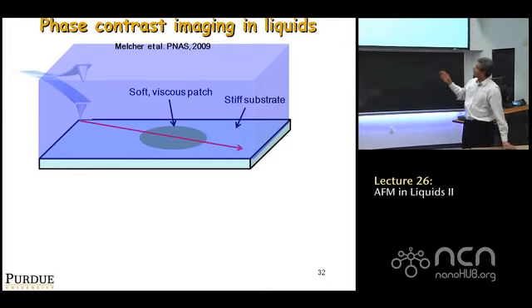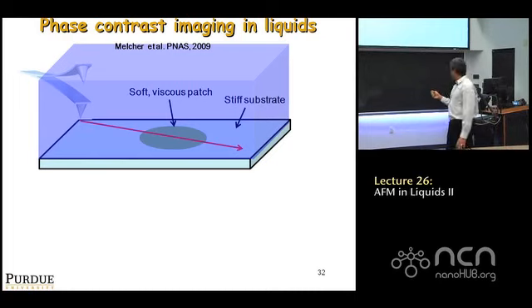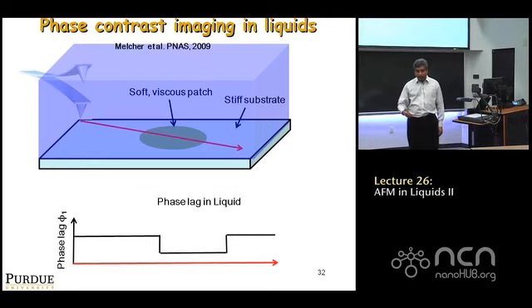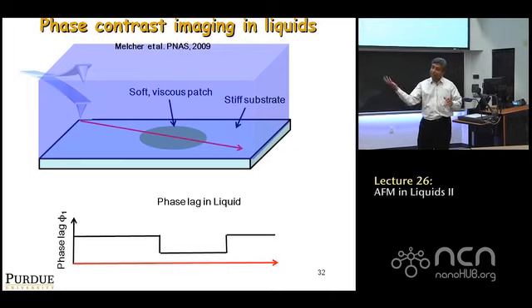But the point is that in liquids, because of this ringing, I already showed you get much more ringing on a hard substrate, right? What we would expect then is the following. Because of this effect, you would get more energy loss on a hard substrate, not because viscosity is greater, of course not, but rather because when you're on a hard substrate, you're making it ring. You're making the higher eigenmodes ring, and there's a big energy loss that goes into the higher eigenmodes.